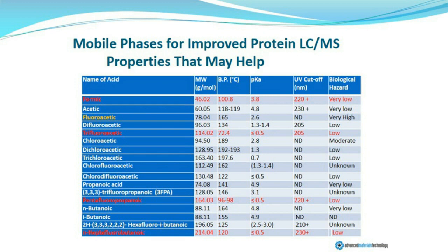Those in red are ones that have been reported in the literature previously. Most of them are fluorinated materials, and included in this is a variety of halogenated and fluorinated carboxylic acids and weak acids that we have also studied in some detail.